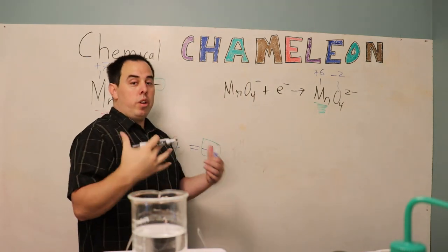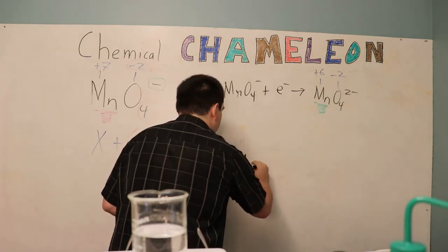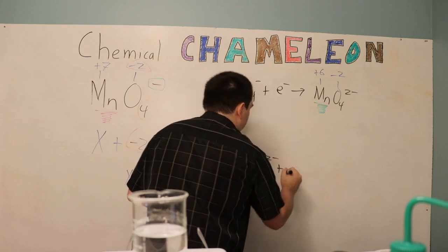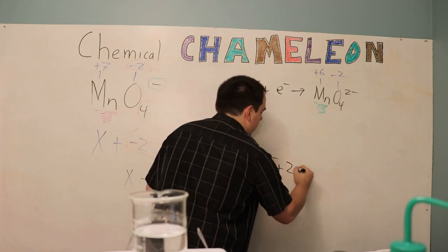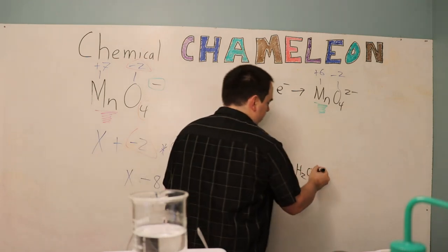Then it will go ahead and further react with the sugar and be reduced more. So we'll go from MnO4 2 minus. Now this is going to be a little bit slower reaction because I added in some hydroxide. I made a basic solution.